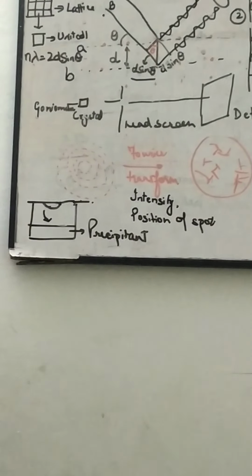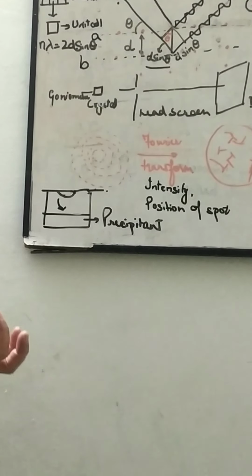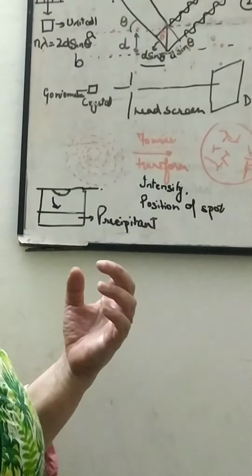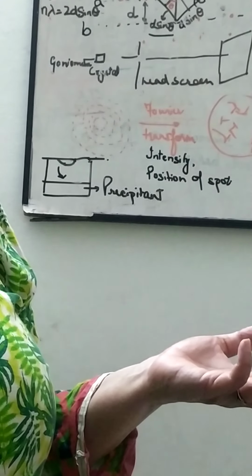It can also be formed in capillaries. It can also be formed in oils, the micro drop technique. So, with the help of these techniques, first of all, you should have a crystal. Now, what should be the properties of this crystal?